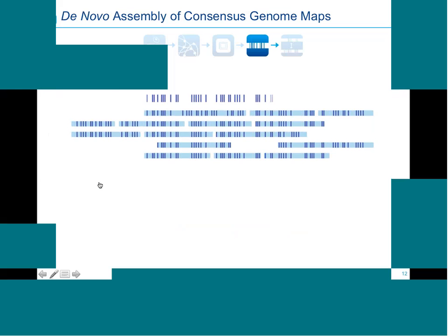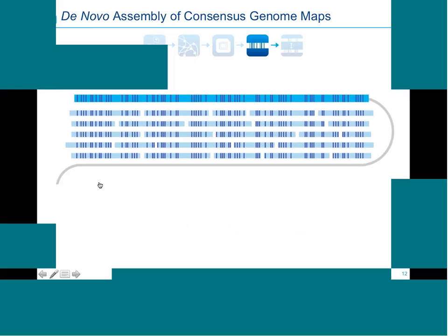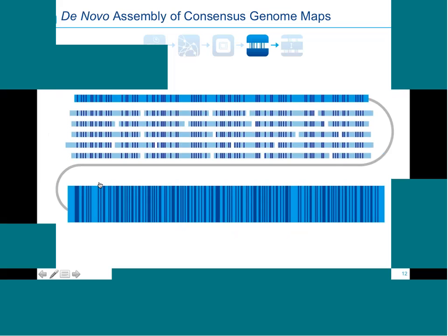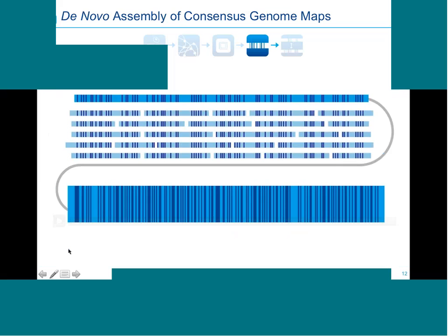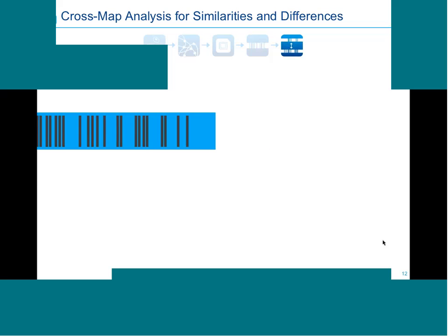But in particular, the ones that I'm showing in the cyan boxes here are on the order of up towards a megabase. So they could, in theory, be assembled utilizing genome maps and PacBio data, particularly structural variants in the 10,000 base pair to 100,000 base pair range. So what are some of the specific regions in particular, and how does the next-gen data stack there?